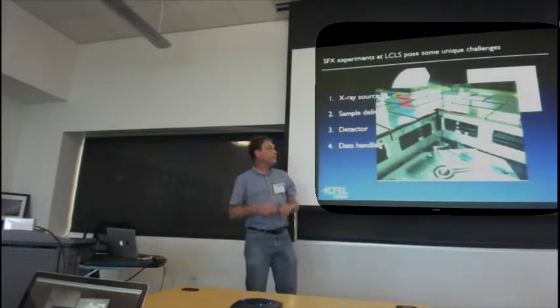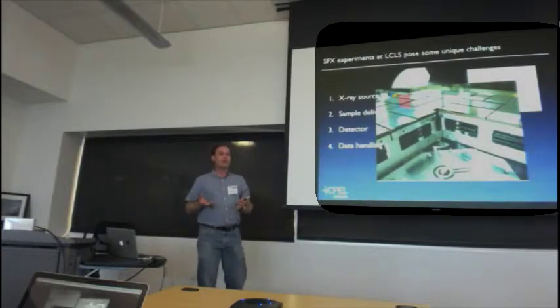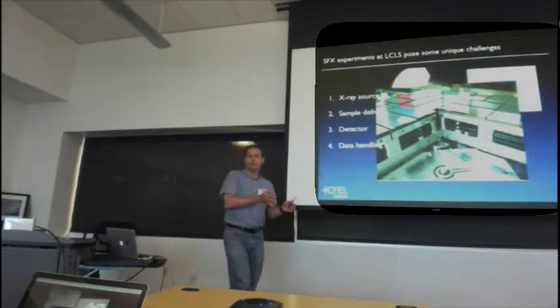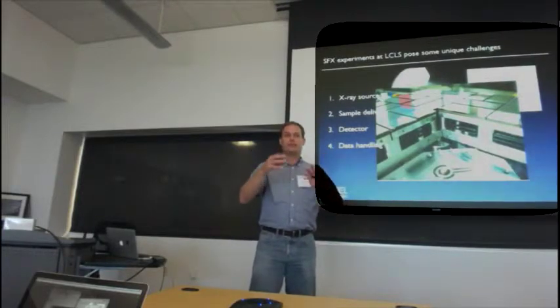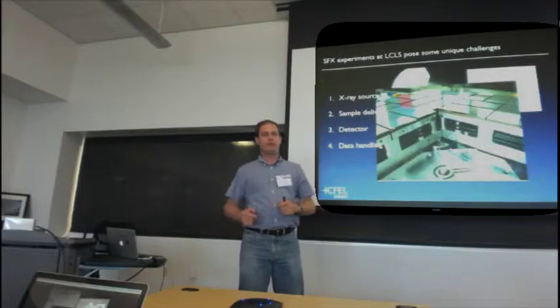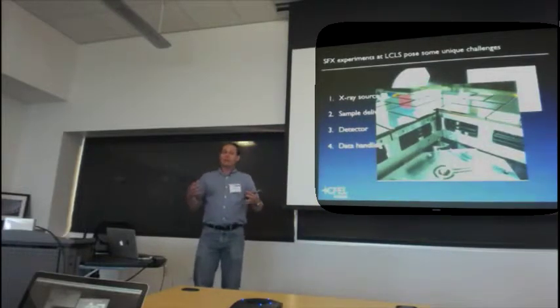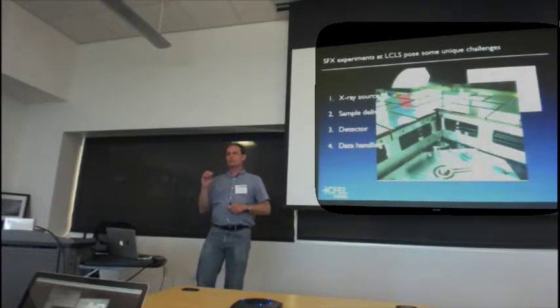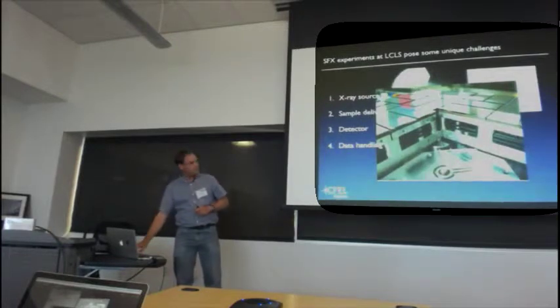So these were developed for LCLS, and over the course of the past 3 years, they've come a long, long way, but some of the early experiments turned out to be pretty tricky to analyze because of detector artifacts that now, over time, as things have been developed, have got a lot better. So actually understanding a lot about the detector and its limitations is fairly critical too, because it's not quite as well controlled as what you get on a synchrotron.